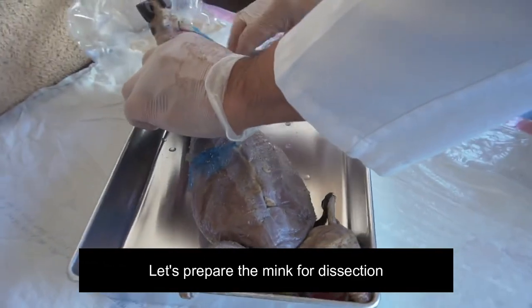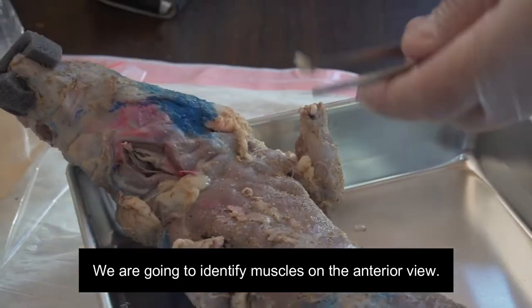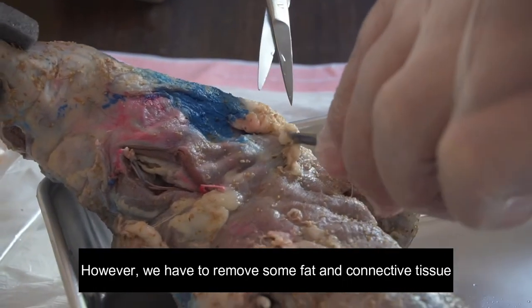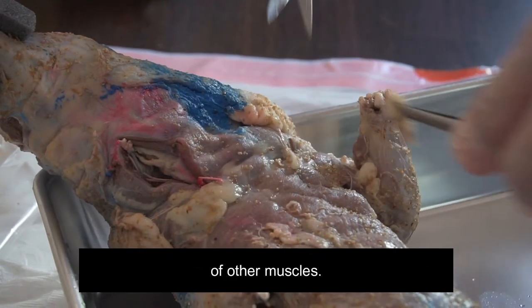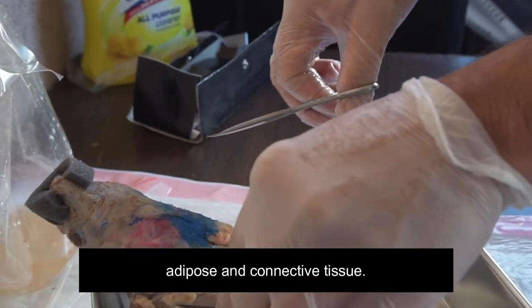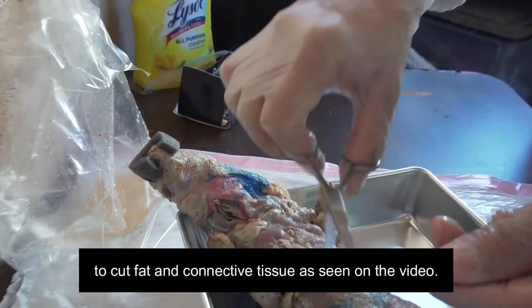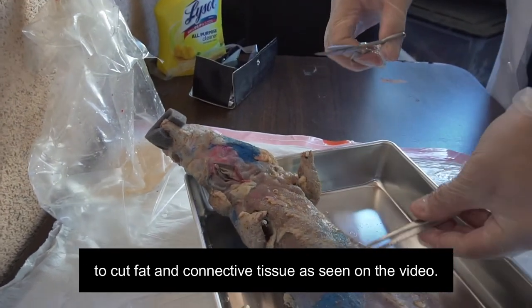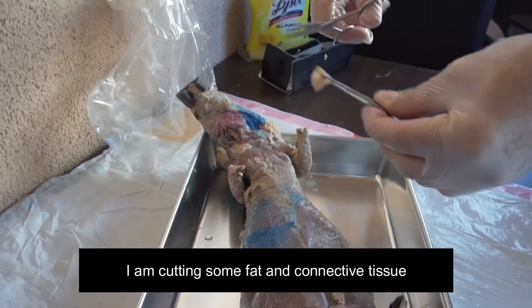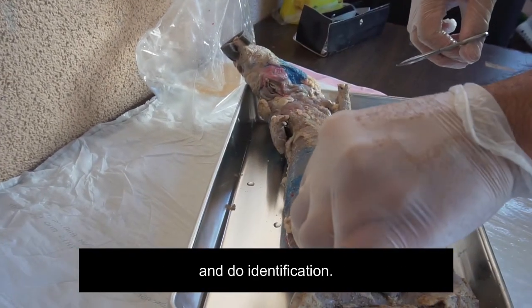Let's prepare the mink for dissection. We are going to identify muscles on the anterior view. Most of the muscles look clean; however, we have to remove some fat and connective tissue from other muscles. Please use the forceps to remove adipose and connective tissue in order to uncover muscles. You could use scissors or the scalpel to cut fat and connective tissue as seen on the video. Please be careful not to do deep cuts. I am cutting some fat and connective tissue in order to uncover muscles and do identification.